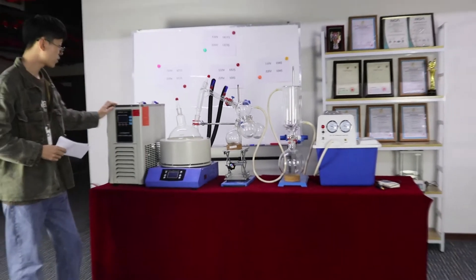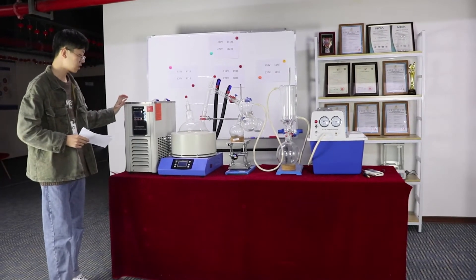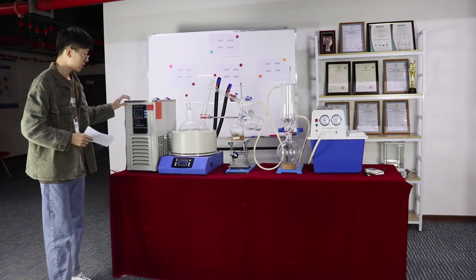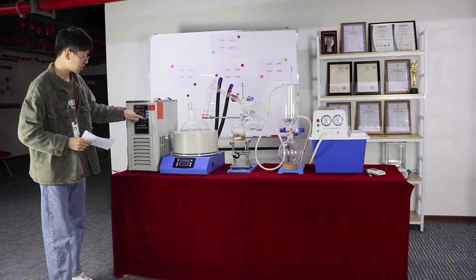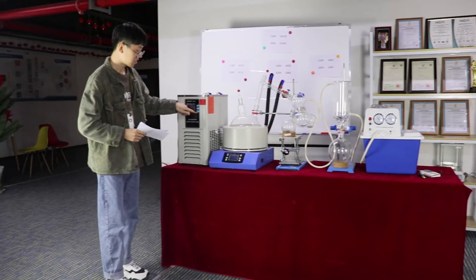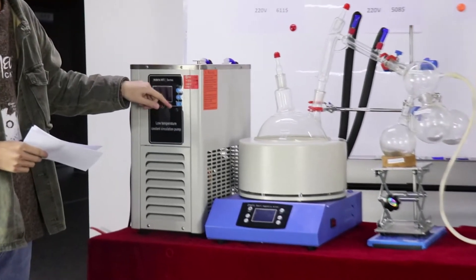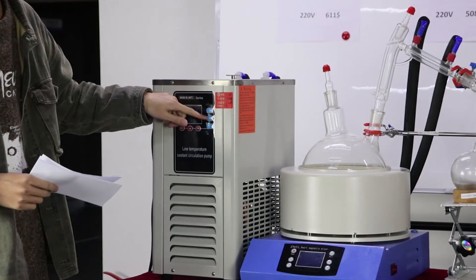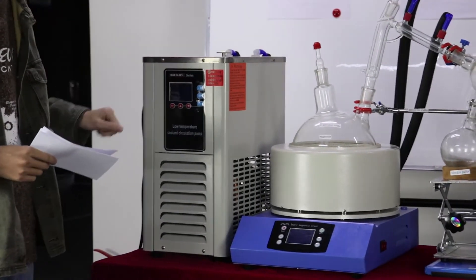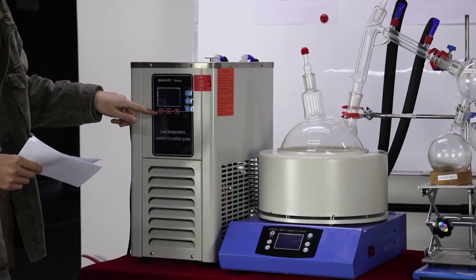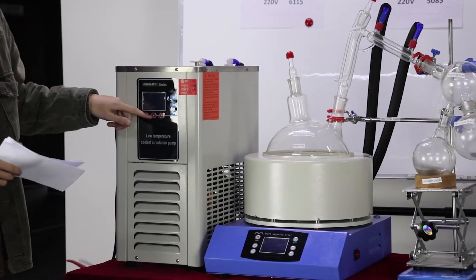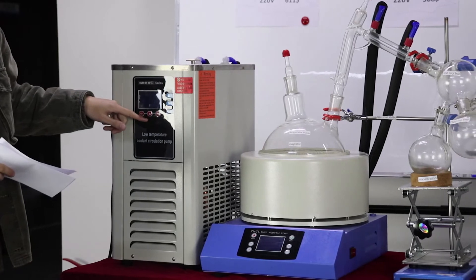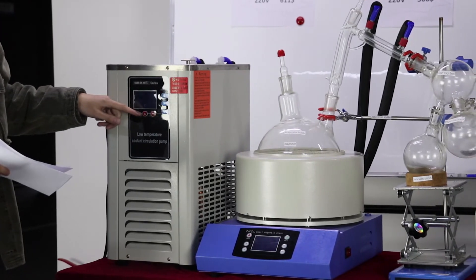This is cold chiller, cooling chiller. This is a switch: refrigeration and cycle. This is sighting. It can adjust the temperature and time.